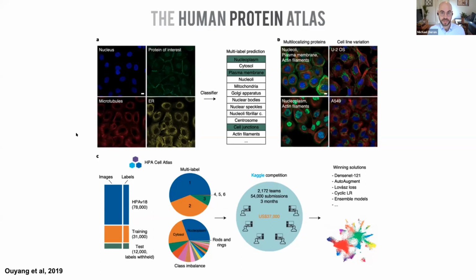without using any labels. So we applied DINO, we trained this self-supervised model on this data. What you see here is the UMAP embedding of the feature space learned by DINO on this data. And you can see that without any labels, we already see some interesting structure here. We already see some isolated clusters. So we thought, okay, we may have been able to solve it from the get-go.